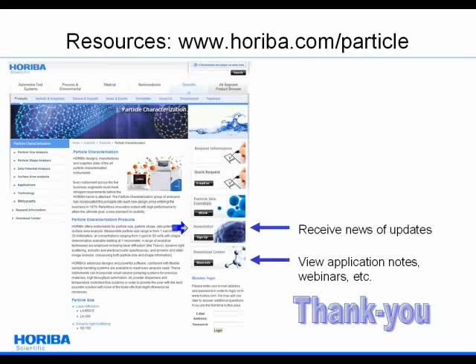If you bring a high concentration, highly viscous sample up to a laser diffraction analyzer, you're always going to dilute it. There's no way around it. And you're going to dilute it and then get results. And what we usually do is we say, since the measurement is so fast, we don't think there's major changes in the size distribution, but out of those two techniques, the only warning I'm going to give is if you're tempted to use dynamic light scattering at high concentrations, make sure you do a dilution study.